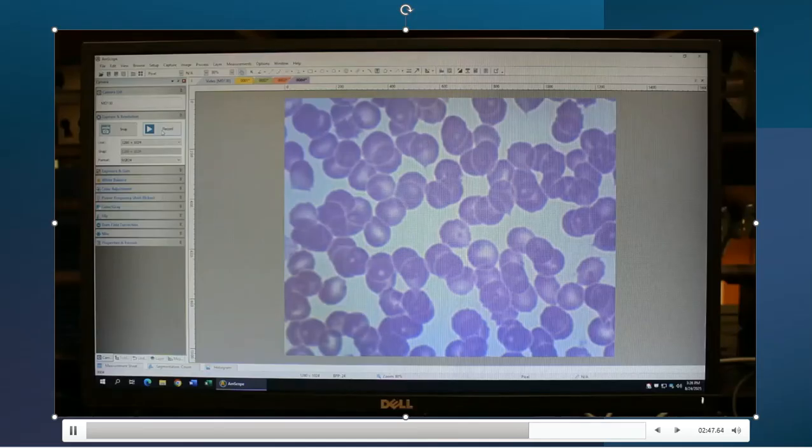All right, so if you have any problems trying to get something magnified or zoomed in, please let us know in the lab. We have at this moment 2 microscopes. We might have more by the time you get into the course, but we've got 2 microscopes that we can kind of alternate back and forth on, and 2 people at a time can be in here working on these.